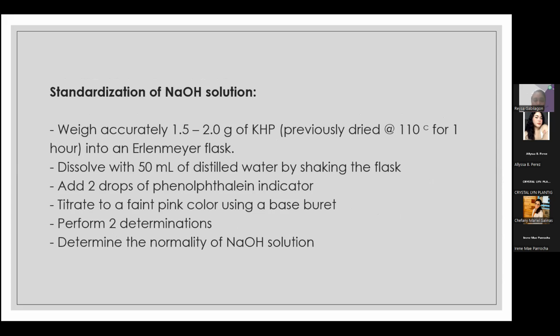So after nyo ginawa yon, yung sodium hydroxide solution yon, nag-standardize tayo using a primary standard. Okay, I hope you will not forget that. Again, ang ginawa nyo for the standardization of sodium hydroxide solution is you used a primary standard, and that is the potassium hydrogen phthalate.